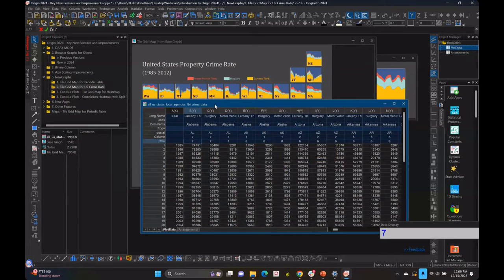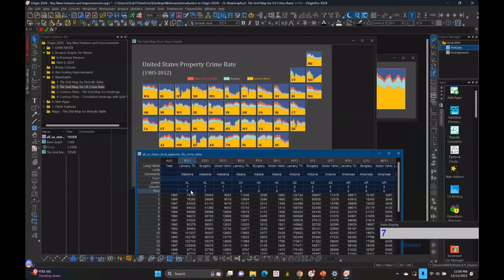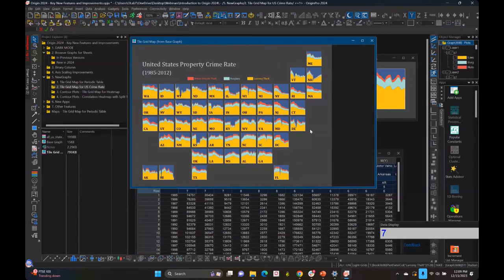So here, as you can see, it's saying Alabama should be at position 7, 7, Alaska is at position 1, 8, etc. So this is showing a representation of the continental US map roughly, of course, but here is Florida, as you would expect. Here is Texas. So you cannot plot this kind of data on a real geographical map.